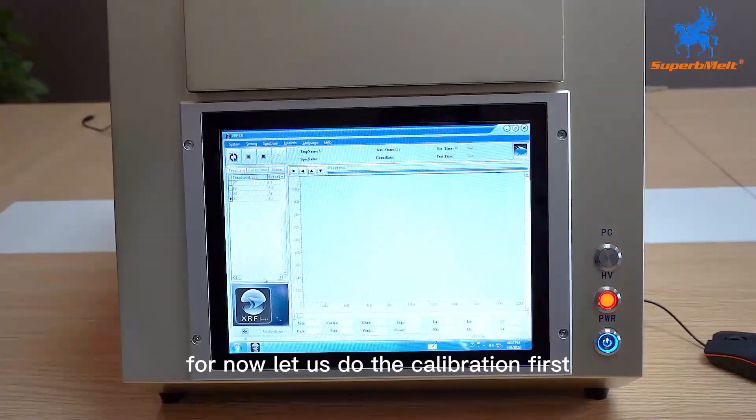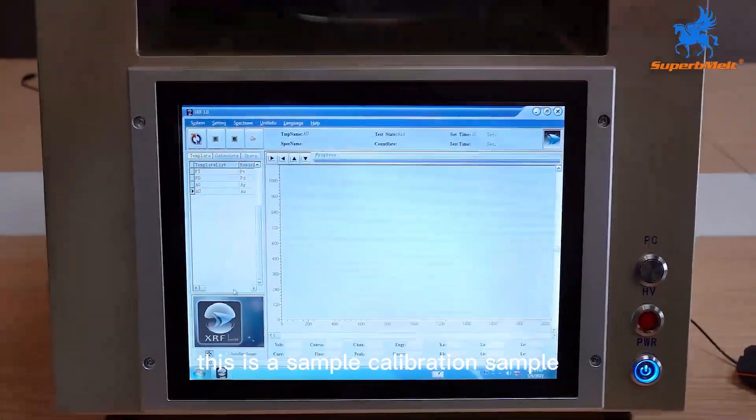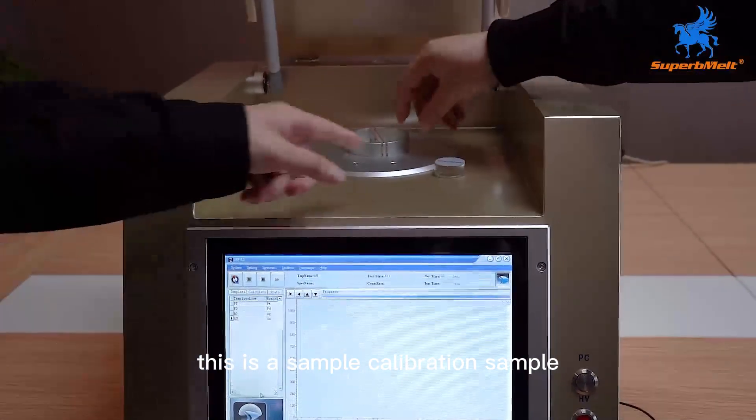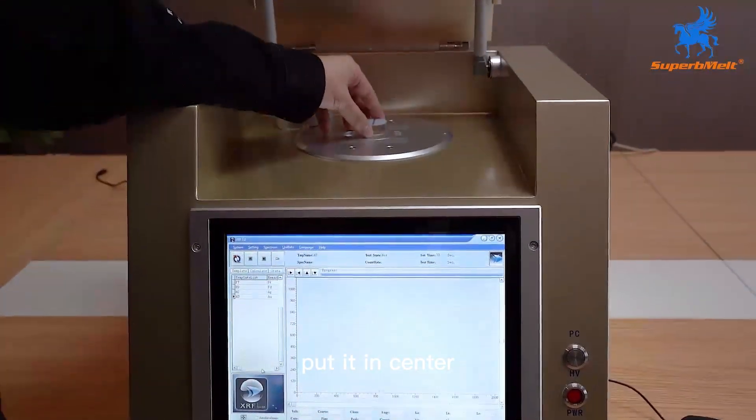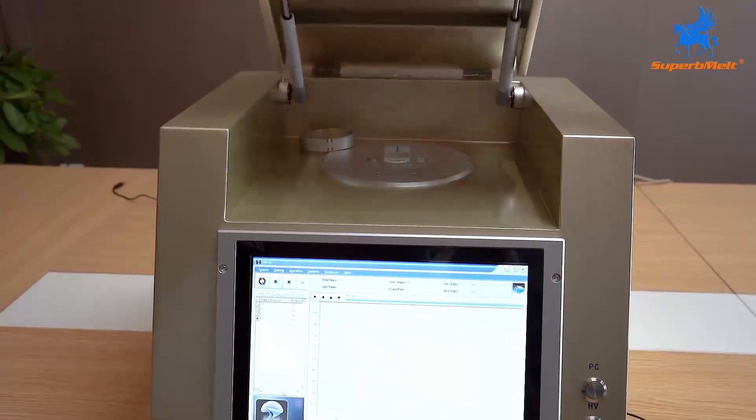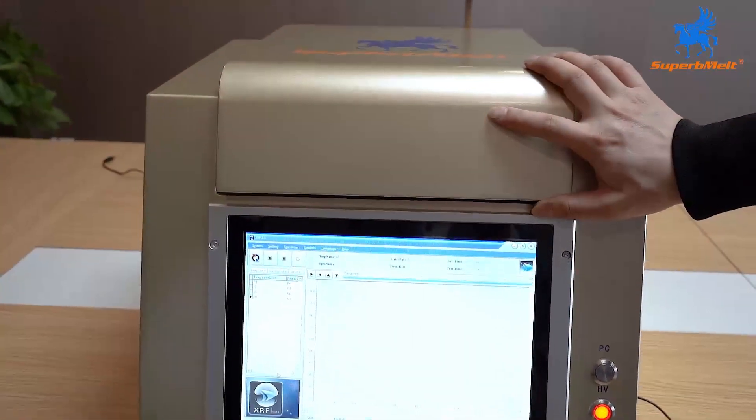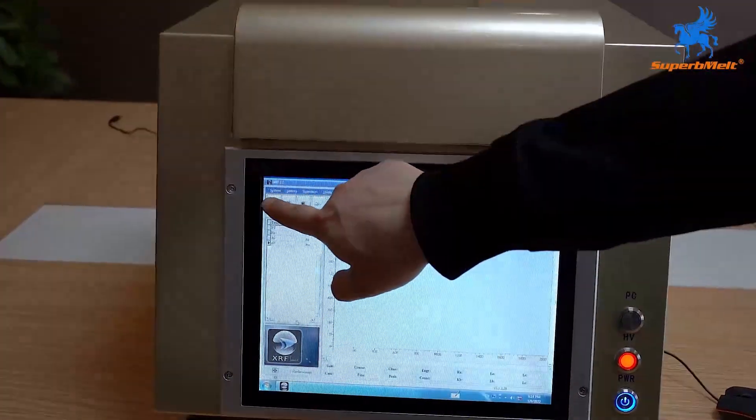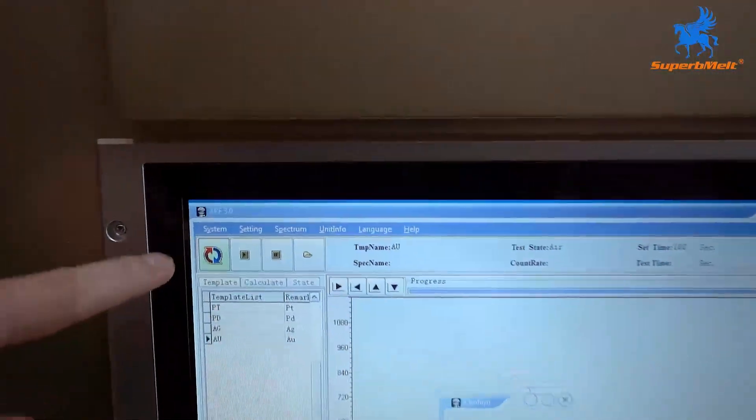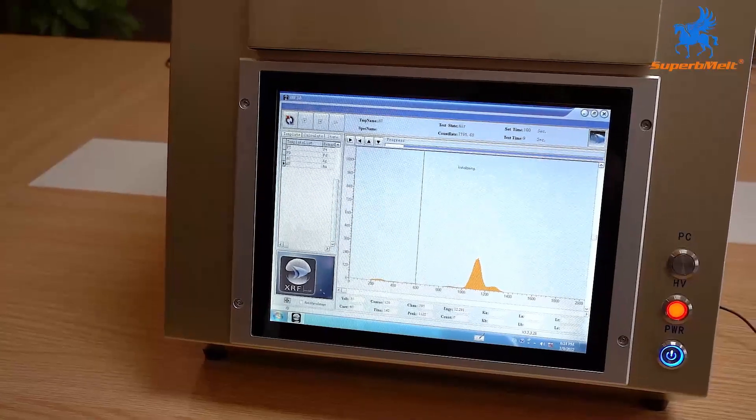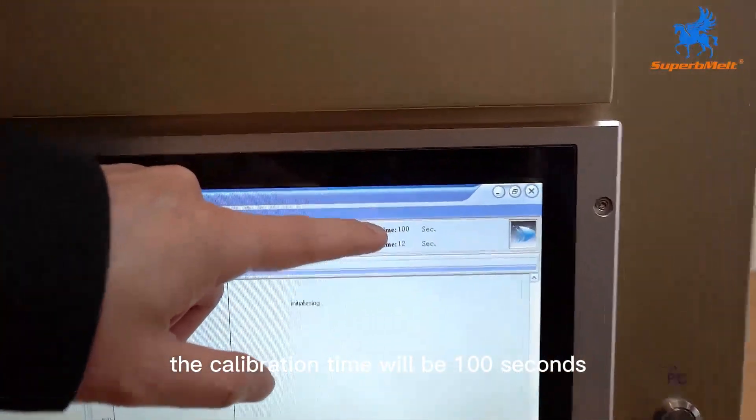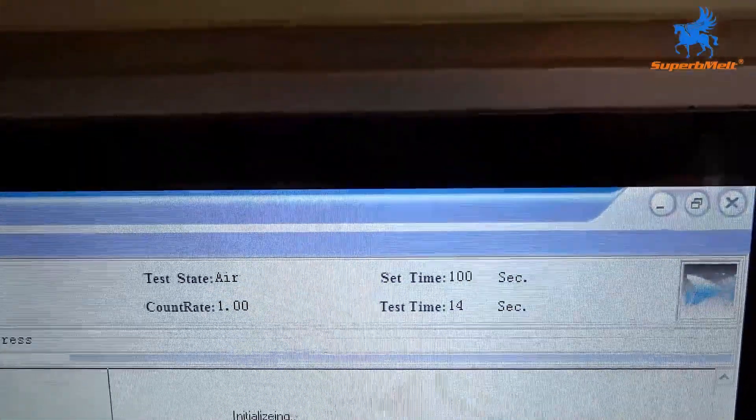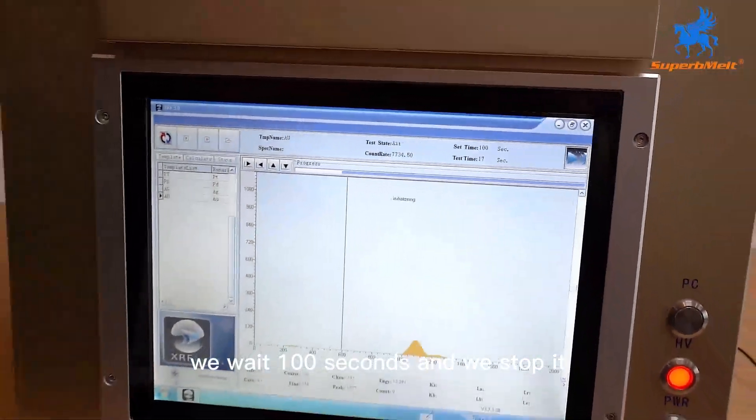For now, let us do the calibration first. This is the calibration sample, put it in center. Press here, and the calibration time will be 100 seconds. We wait 100 seconds and we stop it.